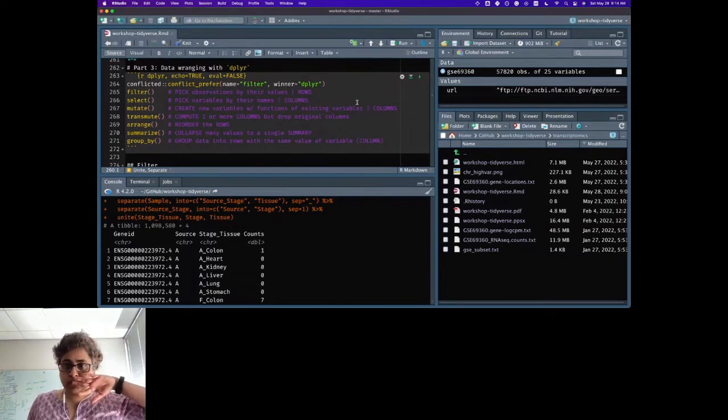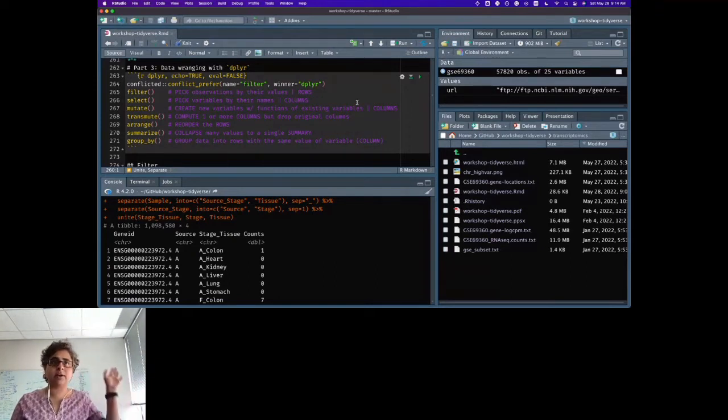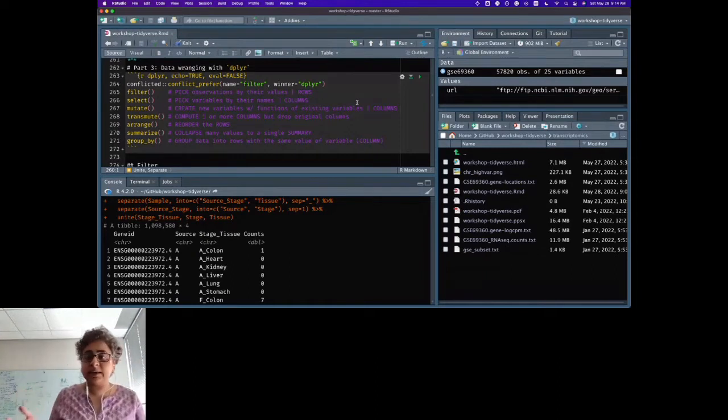I've just posted it from the Google Doc into the chat. No, this was not a BAM file. I've done the transcriptomic analysis and converted it to a counts table. I'm not showing you here how to do the transcriptomic analysis, but just saying that if you've done a transcriptomic analysis and you have a tab delimited file, which is the counts table in this case, if you have that as an output of your transcriptomic or RNA-seq analysis, that is what you would input here.